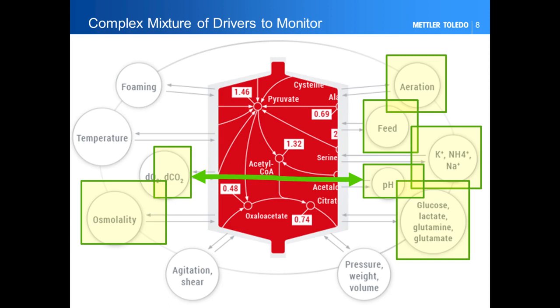So for pH, it is important to always remember that a buffered system will artificially impact the pH at desired set point and ultimately impact its control, since dissolved CO2 is accumulating. And it's necessary to strip this excess of CO2, which will also influence the formation of foam and ultimately affect the pH, again, its fluctuation, and therefore its control.